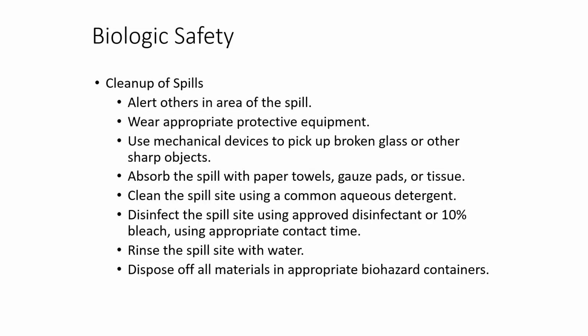Absorb the spill with paper towels, gauze pads, or tissue. Clean the spill site using common aqueous detergent. Disinfect the spill site using approved disinfectant or 10% bleach, using the appropriate contact time. Some people will just spray the bleach on there and immediately wipe it up. There should be some time where the bleach has an opportunity to interact with the particles, to give it enough time to prevent further hazard. Rinse the spill site with water and dispose of all materials in appropriate biohazard containers.